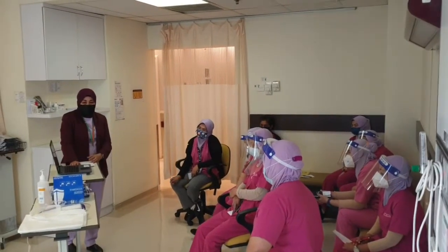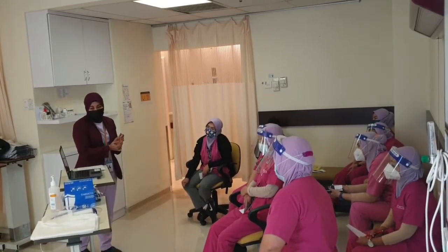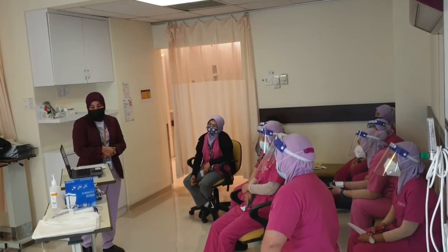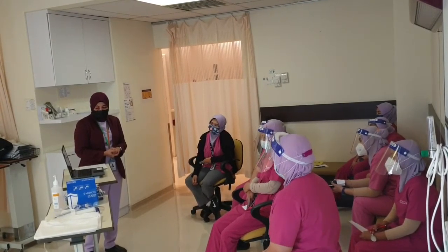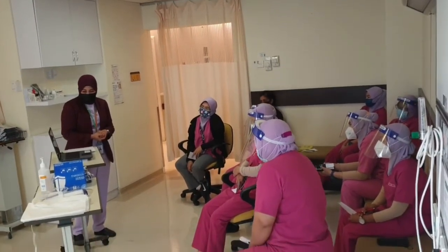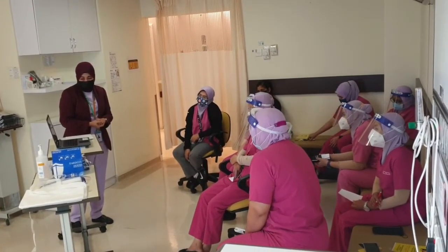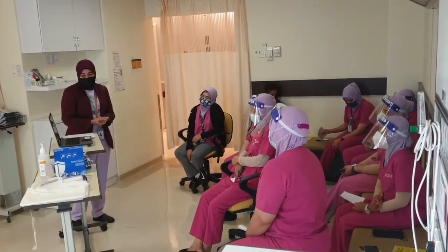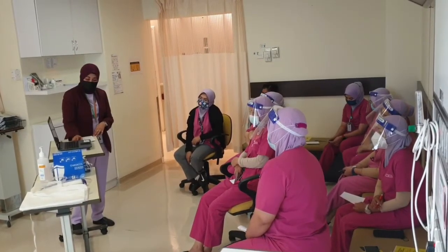For the gown, it is the same: the gown front and sleeves are also contaminated. If your hand becomes contaminated during gown removal, immediately wash your hands or wipe with alcohol-based hand sanitizer. Unfasten the gown ties, taking care that the sleeves don't touch your body. Pull the gown away from the neck and shoulders, touching the inside of the gown only. Turn the gown inside out, roll it into a bundle, and discard in the waste container. These steps need to be followed.